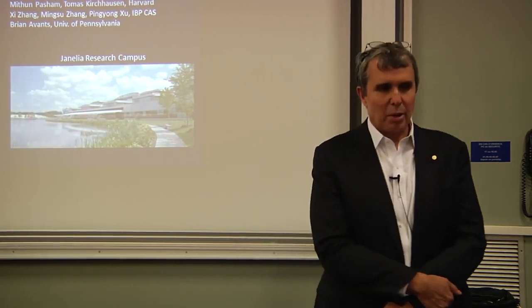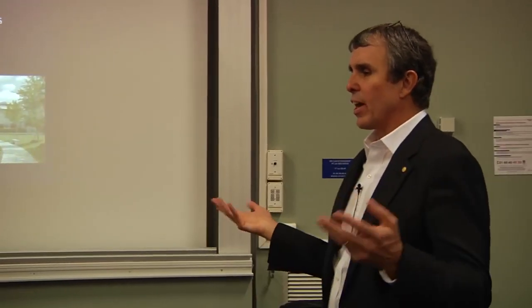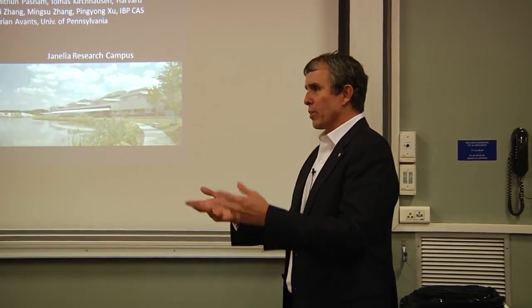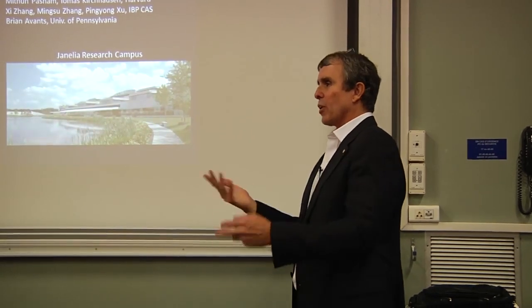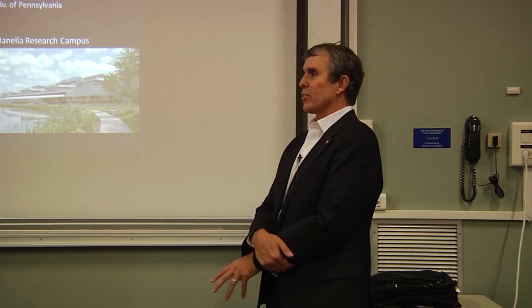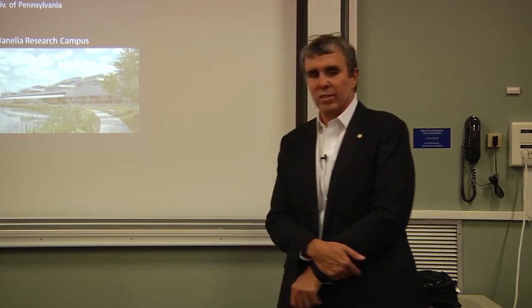Minimal processing, I'd say. I mean, the SIM obviously, SIM and localization, every super resolution method involves some processing in terms of getting the result. Not as sophisticated as what you do in the low SNR regime and say cryo-EM and the particle averaging and all the rest that goes on. Although that's a testament for how great image processing can be, because cryo-EM is in a freaking revolution right now because of the cameras coupled with the image processing capabilities. So, but really what's needed is ways of handling the big data that we have.